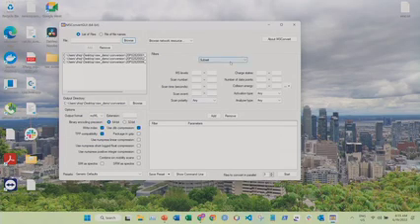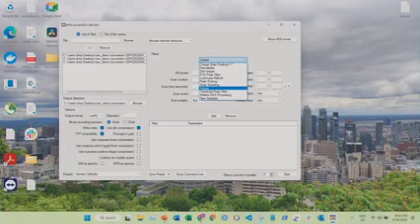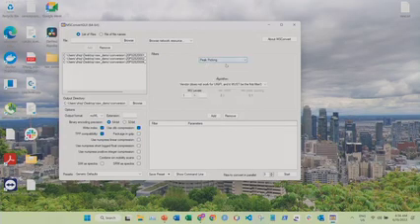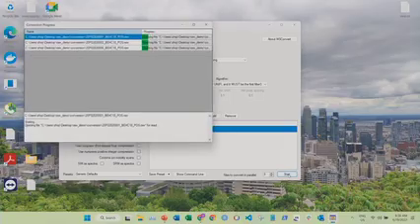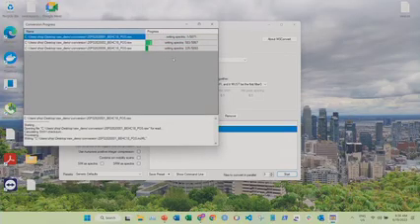Many people have a lot of questions about how to do data centroiding. For MetaboAnalyst, we only support the centroid mode, so this is the most commonly asked question. Here I want to quickly show you: we have to select the peak picking and add this peak picking condition as the first one. We can do the data conversion in parallel mode. You don't need to follow, just see what I'm doing. We click start, and it's going to be converted directly. It should be very fast.